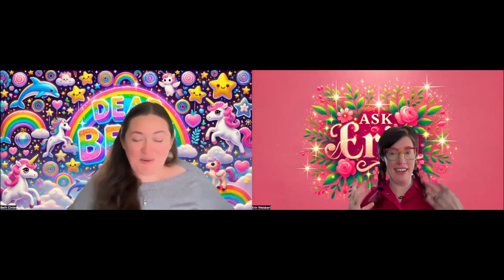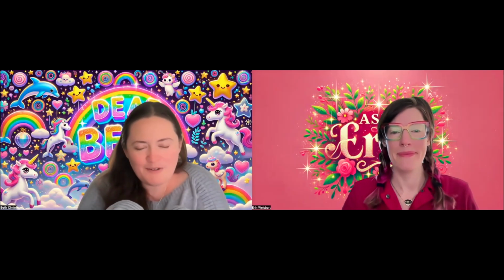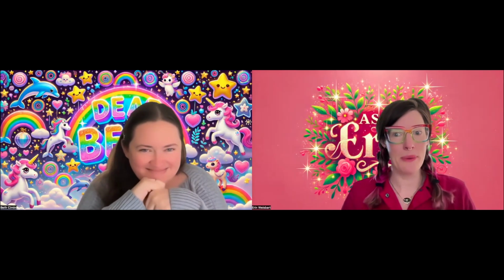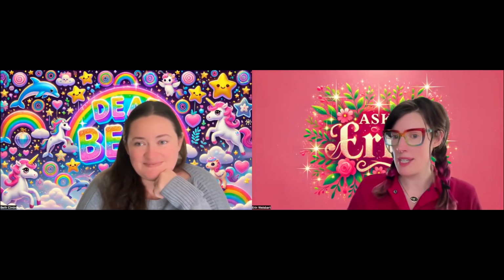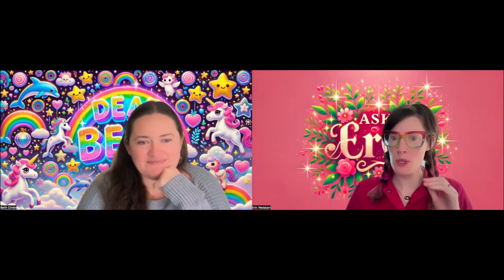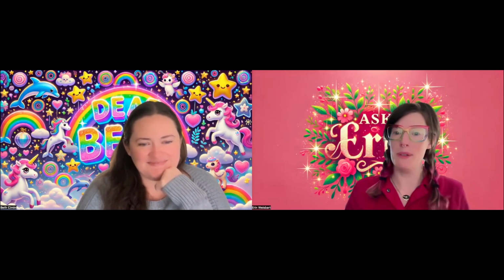You will look absolutely cute, and I know that you know all this stuff, but I think it's definitely the hardest part of CellProfiler. Would you agree? Absolutely, I still get very frustrated and struggle with names and types, which is really silly because I do actually know how to use it at this point in time. But from my first week in lab, I established an adversarial relationship with names and types, and 6+ years later, I won't let it go. I don't like that module.